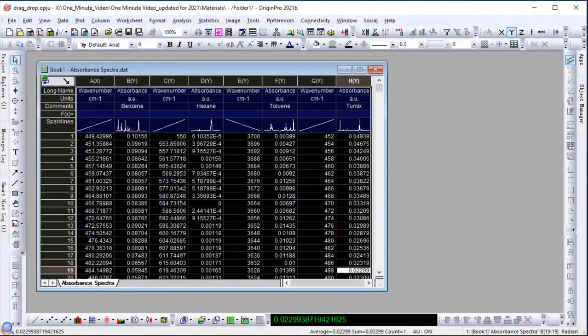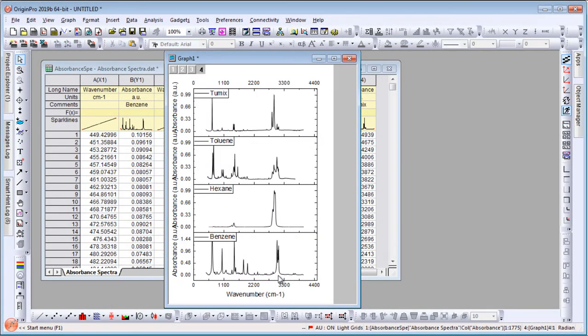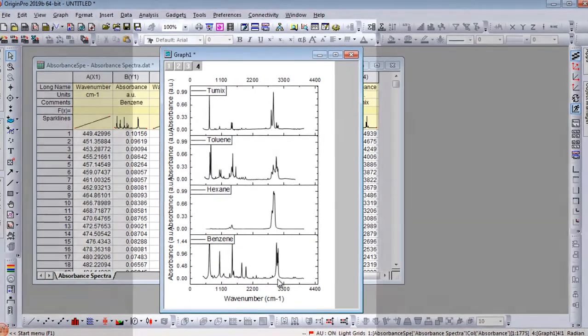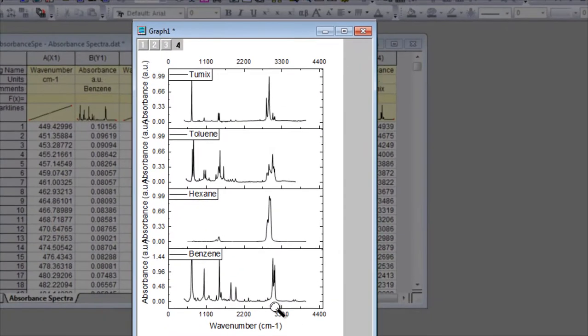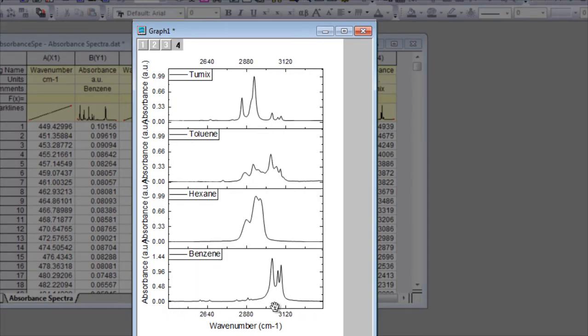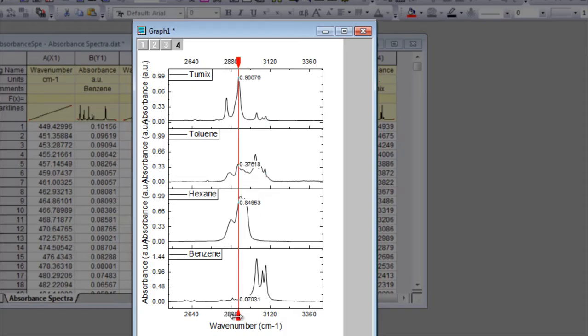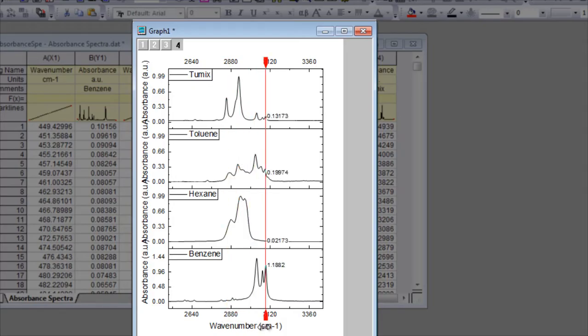Simply select the data on a worksheet and click the desired plot button to create a graph. Zoom and pan into the axis scales to interactively explore your data. Use tools such as a vertical cursor to read values.